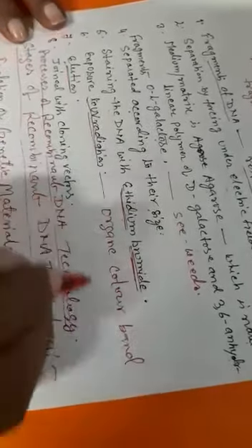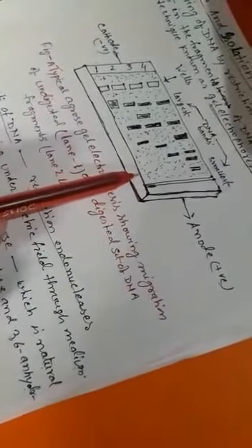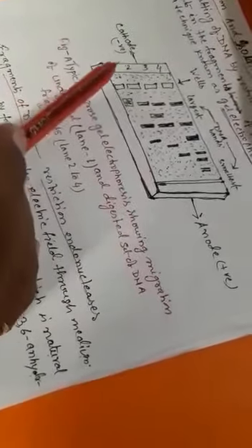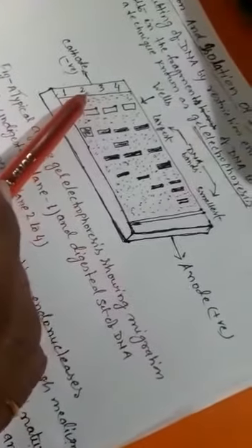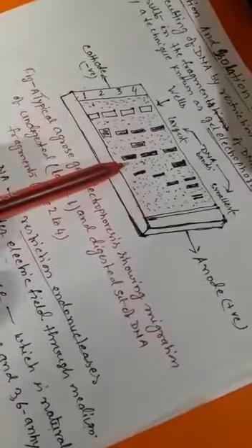So these are the methods. The diagram is a typical gel electrophoresis showing migration of undigested DNA in lane 1 and digested sets of DNA fragments in lanes 2 to 4. So these are the device and techniques and a typical agarose gel structure.